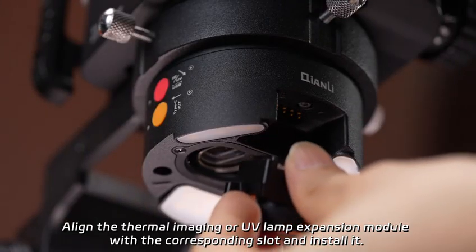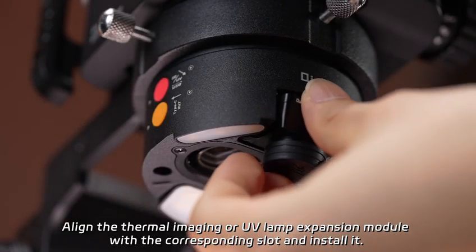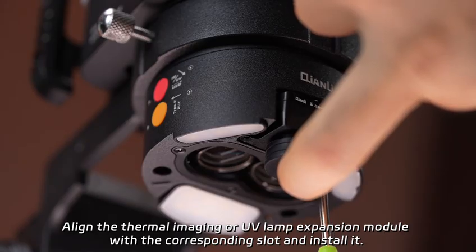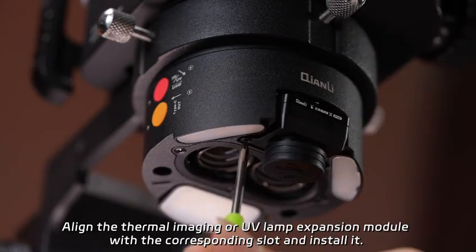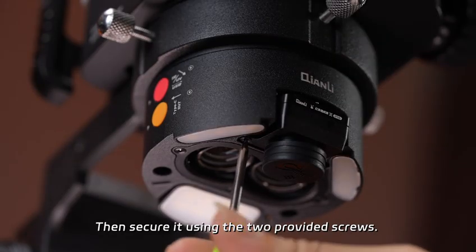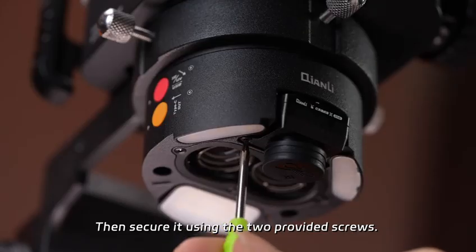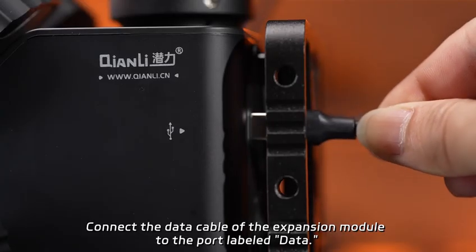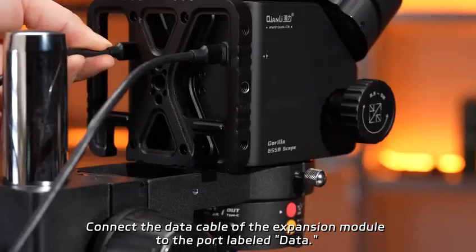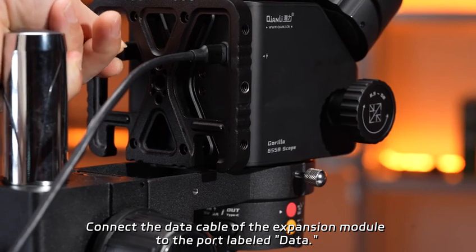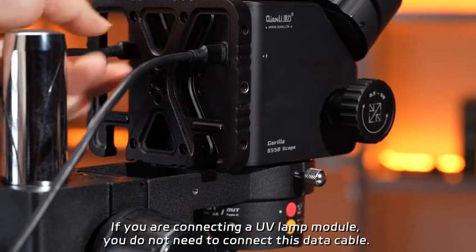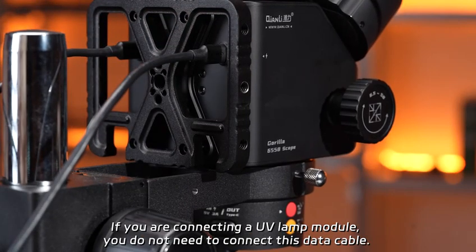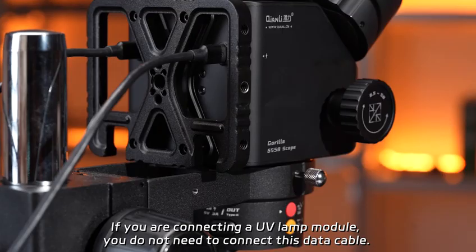Align the thermal imaging or UV lamp expansion module with the corresponding slot and install it. Then secure it using the two provided screws. Connect the data cable of the expansion module to the port labeled Data. If you are connecting a UV lamp module, you do not need to connect this data cable.